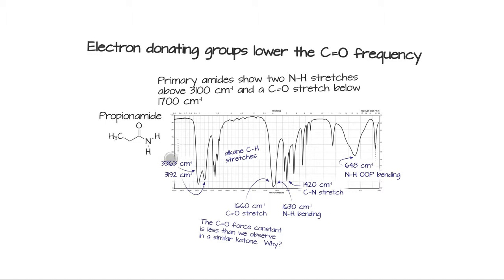is that the NH peak here, there's two of them, because just like in amine, there's two peaks when there's two hydrogens. But this is a really intense absorption band. With amines, we had little low absorption bands here, and this is really intense. So if you've got something that looks like a primary amine, but it's super intense, I'm thinking amide. And then I see a low carbonyl peak, now I'm really thinking amide.